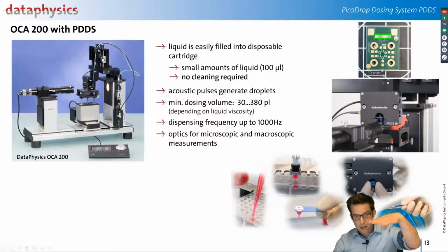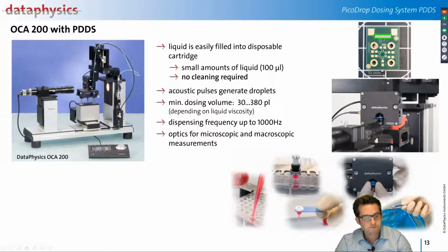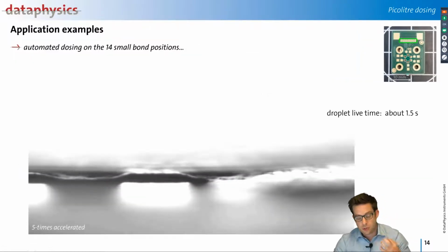Normally with a microscope, you have to bring the objective super close to your substrate. But for this setup, it's not needed. We have a good working distance of 9 centimeters, and even at 9 centimeters you can analyze the substrate very well and have a very high magnification.